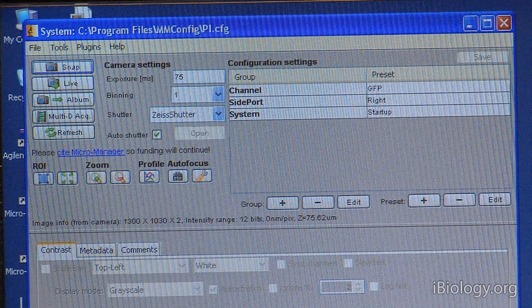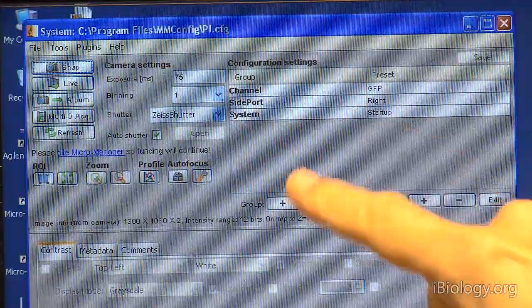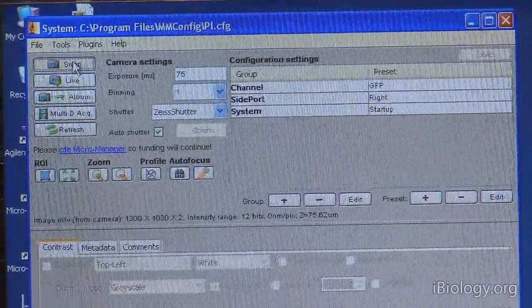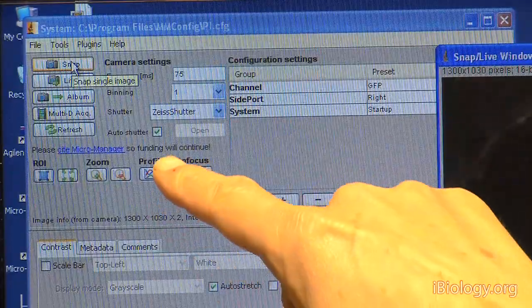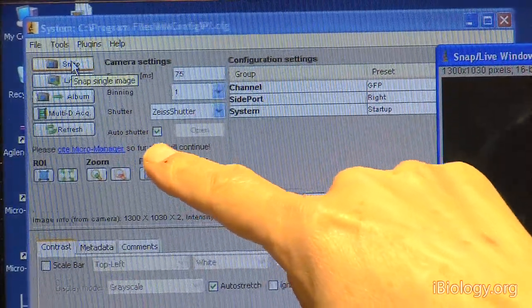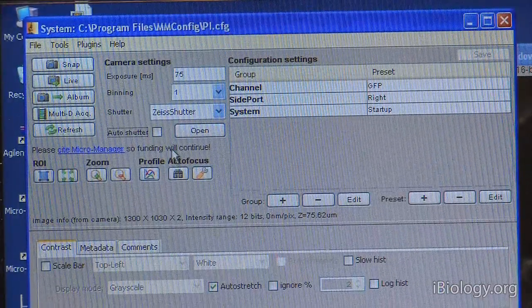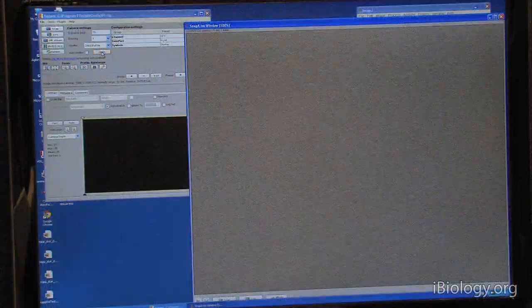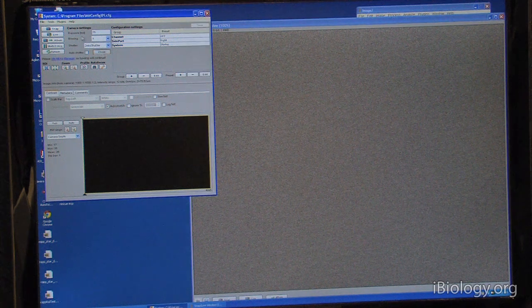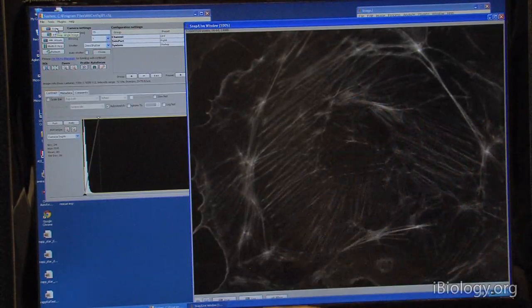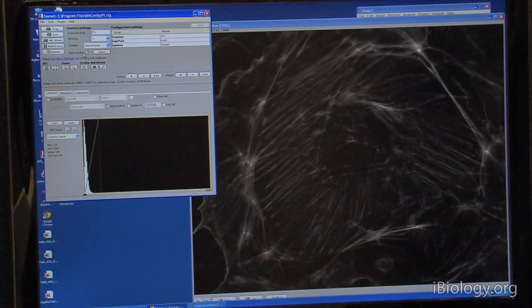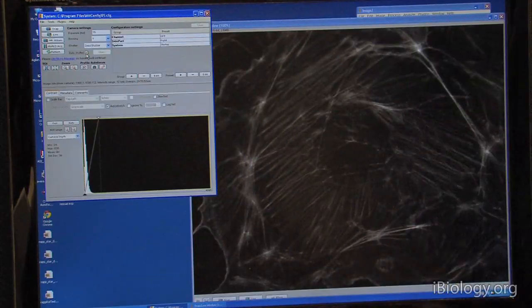Here is the control of the microscope equipment, mainly of the camera. We can set an exposure time and we can snap an image. And so when we snap an image, the software will automatically open the shutter and close it again. And so that is set with this auto shutter checkbox. If I were to uncheck that and then snap an image, we would get nothing. Noise. Since there's no illumination of the sample. But when I open the shutter and then snap an image, it's also fine. But now we're continuously illuminating the sample. So that's not good because we bleach it. This auto shutter makes sure that your illumination is tightly synchronized with the camera.